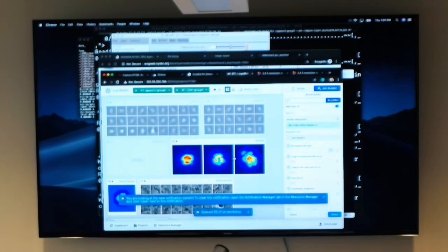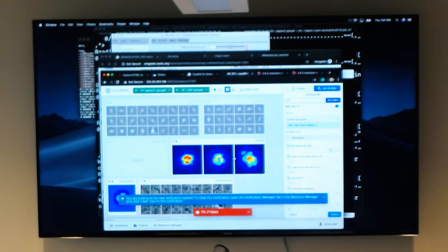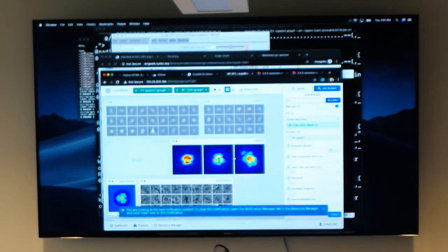The idea is not just to run a job once. Try running it again and try different parameters, because that might be informative to give you a better idea of, let's say I don't have such a good protein, let's say I have a trickier protein. Does changing a particular parameter impact the particular processing job or run? And this is the perfect data set to work on that. And if you run out of all of that, towards the end of your tutorial, you have a couple of additional tasks that you may try that are recommended.